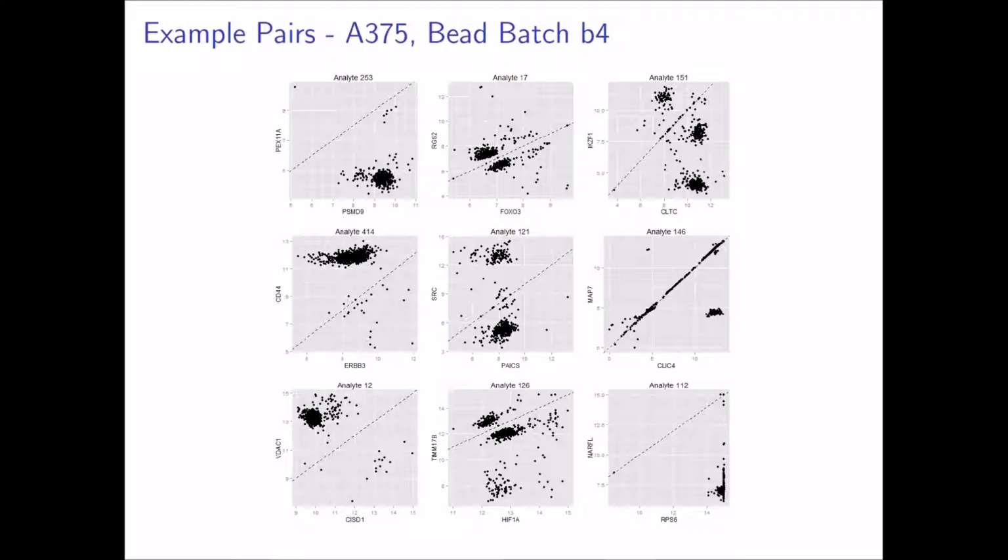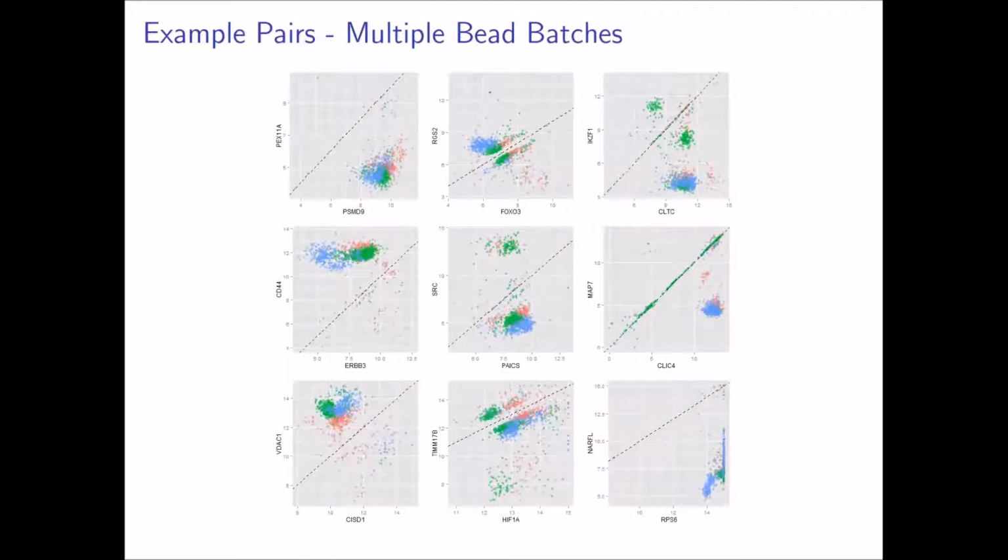I really don't know enough about the biology of things to say. I've thought about that. One issue is, if that were true, it's only showing up for this multi one up in the upper right. It's only showing up for one of the 3 largest bead batches. I'd expect to see something similar in the other bead batches.